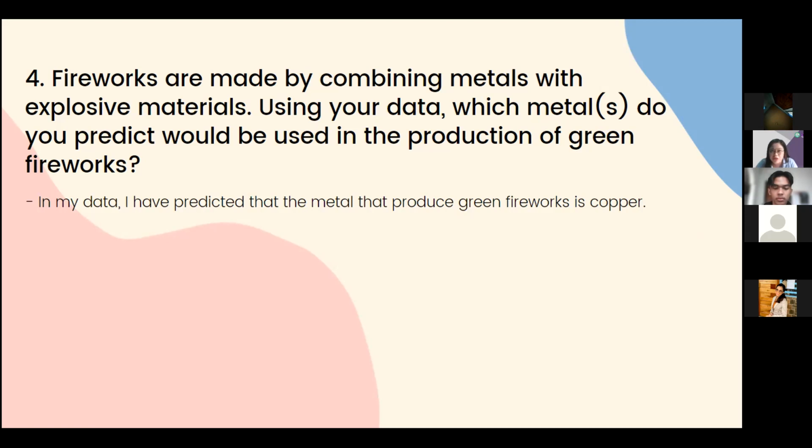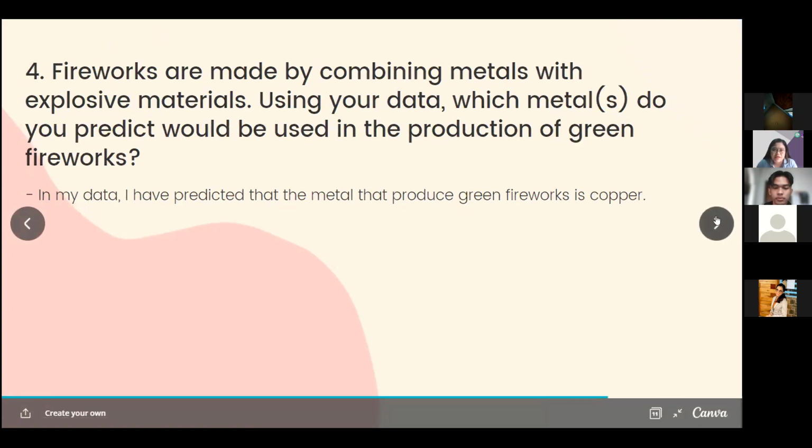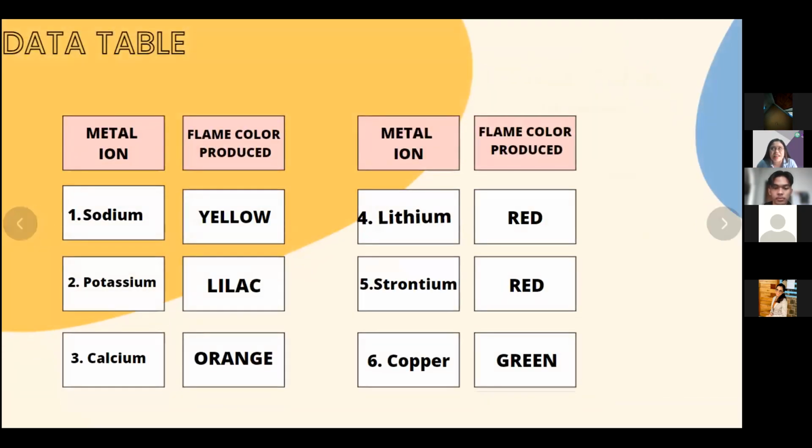Kaya lang wala kasi doon sa table, no? Kasi depende kasi dito nakadepende sa data. Pero just take note that if you want to have a green fireworks, you can have the barium. That will give us the green fireworks. Kasi yung sa procedure, barium pero wala siya sa inyong table, no? But that's okay. So let's check. Yellow. Sodium is yellow. Yes, that is correct. So if you want to have a fireworks na color yellow or color orange, it's between yellow and orange actually. So we have here the sodium.